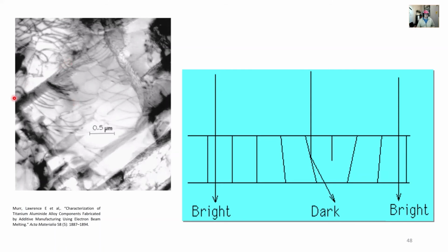And we're also even seeing some other faults here in this material. And so this depiction kind of hopefully makes it a little more understandable. The beam passes through where you have a defect, and this is even showing a dislocation where you have some lattice distortion due to the presence of a fault or a dislocation. The beam is deflected, so it's diffracted really, and so it goes somewhere else. So it doesn't go to the imaging plane.